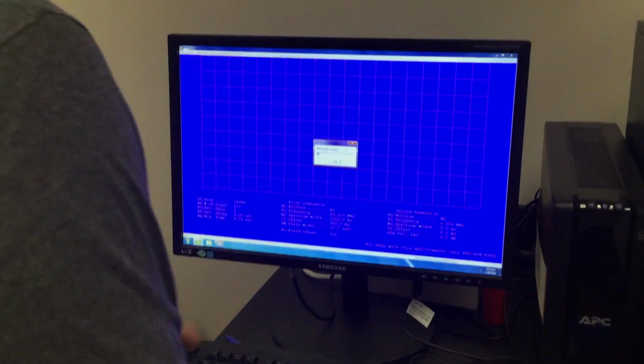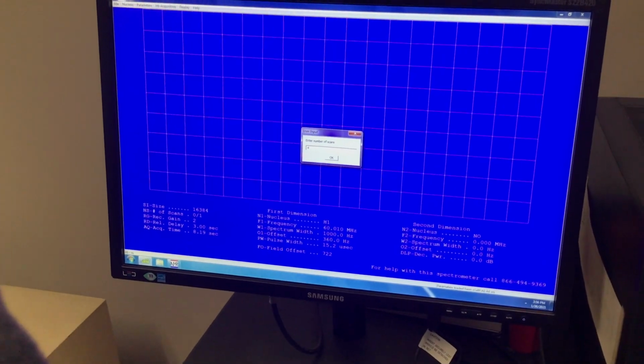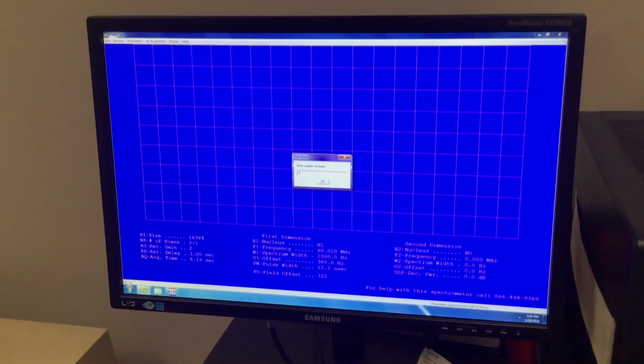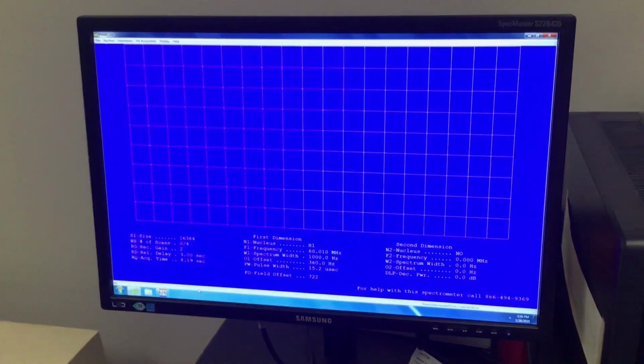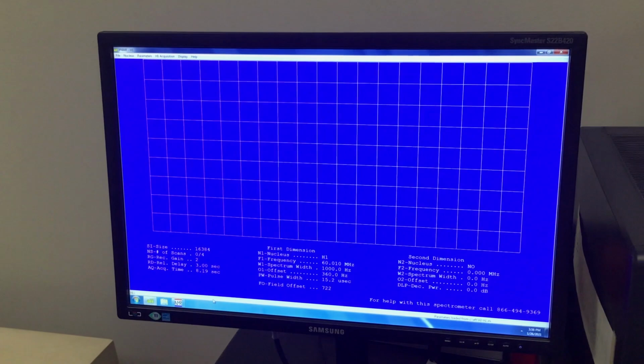And so I'm going to go ahead and say, let's just do 4, because I want it to be pretty fast for the purpose of this video. Dr. Hamilton may tell you to do 8 or 16. They're always going to be multiples of 4, so you can do that. I'm going to choose 4. So now, after I do that, the number has changed to 4. It will run the cycle 4 times, and then it will alert me whenever it is finished.